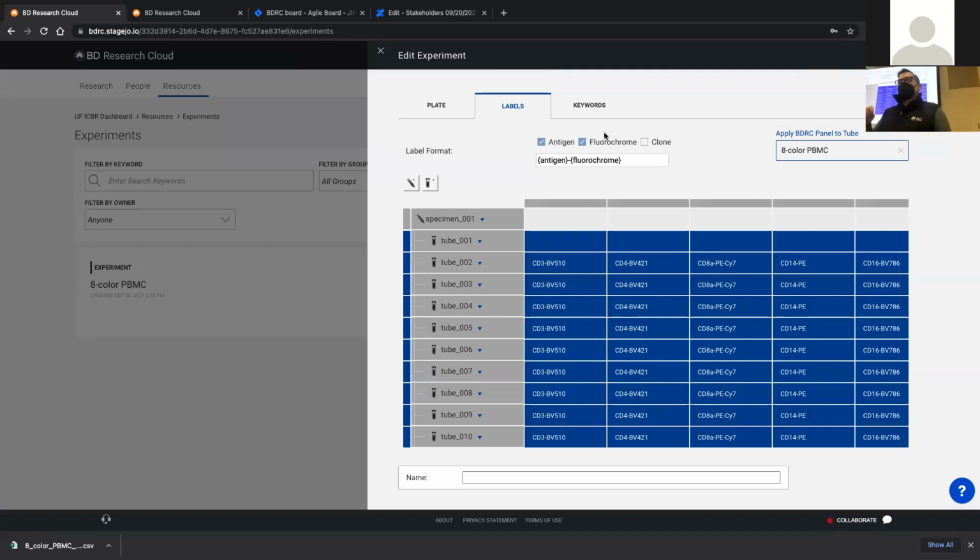You know where I'm supposed to be detecting that, because that was pre-programmed to be that 510 whatever filter off of the violet laser. But it just doesn't know that you want CD3. And you want to make sure in FlowJo, when you have that drop down on the x-axis, that it says CD3 so you can find it later.